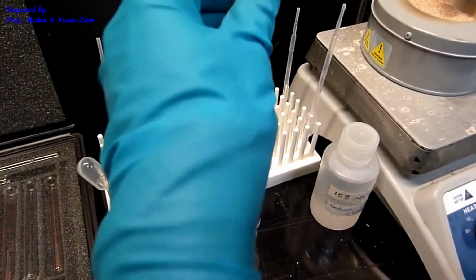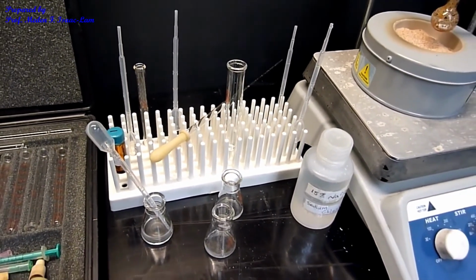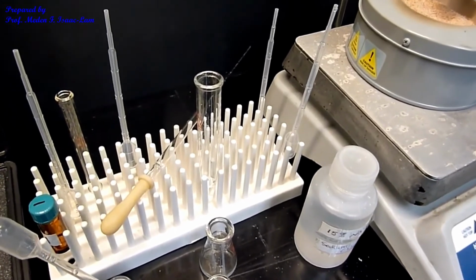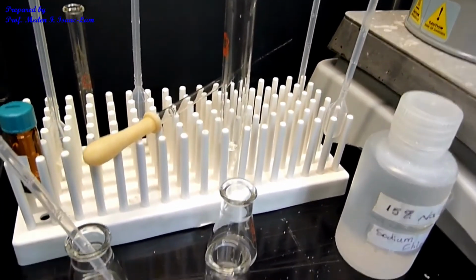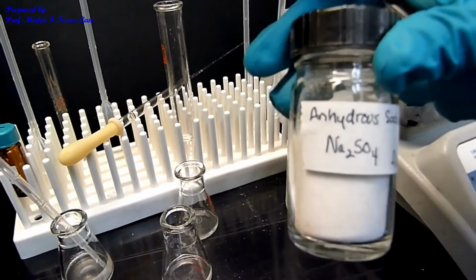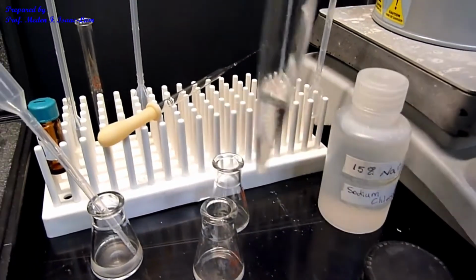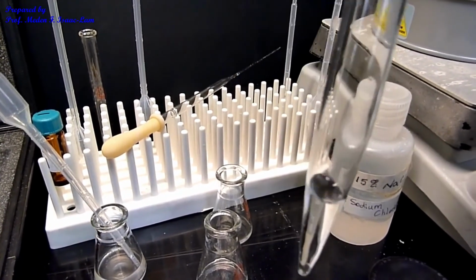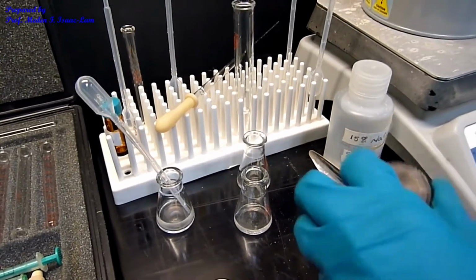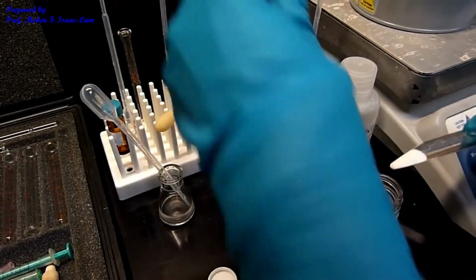So now I'm going to add sodium sulfate. So this is anhydrous sodium sulfate. It's a drying agent. So any water that's still in here will be absorbed by the sodium sulfate, and we're going to get mainly just the ester. So I'm just going to scoop, and then let it sit for a minute or two.